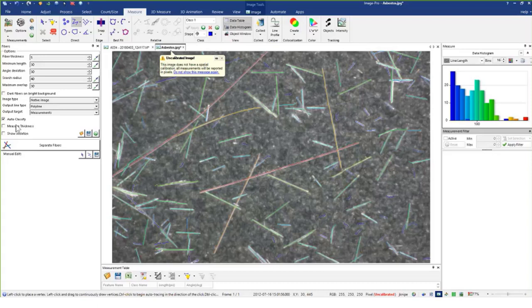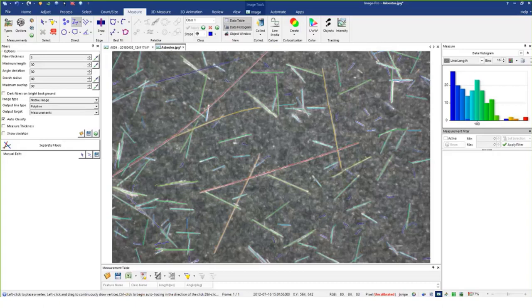Just as a reminder: if you're hand drawing a line, you'll get the length but not the thickness. The only way to get thickness is to start with the native image or a binary mask that still maintains the fiber morphology. So there are a couple of tools that extend the capability of the fiber separation app, coming out with the patch in July. Splitting fibers can also be done using count size. That's really it for the fiber separation tool — it's available from the website and the App Center; you can download it directly into ImagePro.